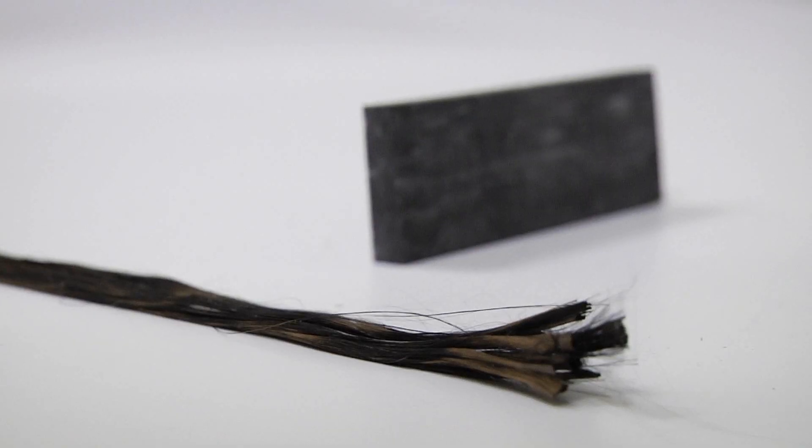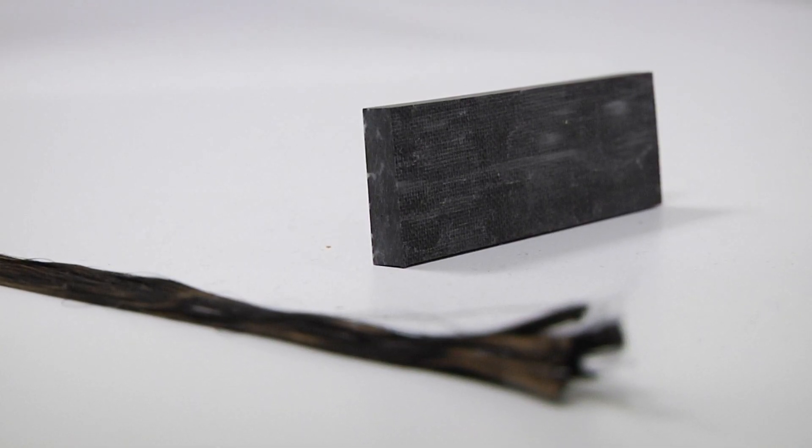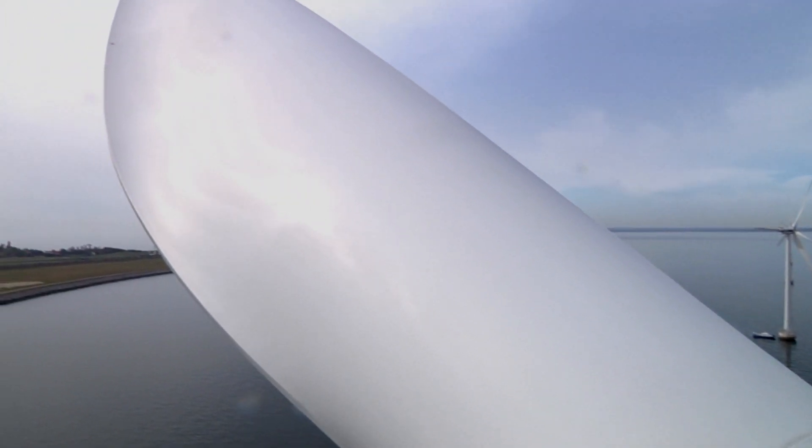One of the key focus areas of the lab is verifying the quality of the carbon fibre composite. A composite is made up of two or more materials and in the case of Vestas' blades, it is carbon fibre mixed with resin to form a strong but light composite material.